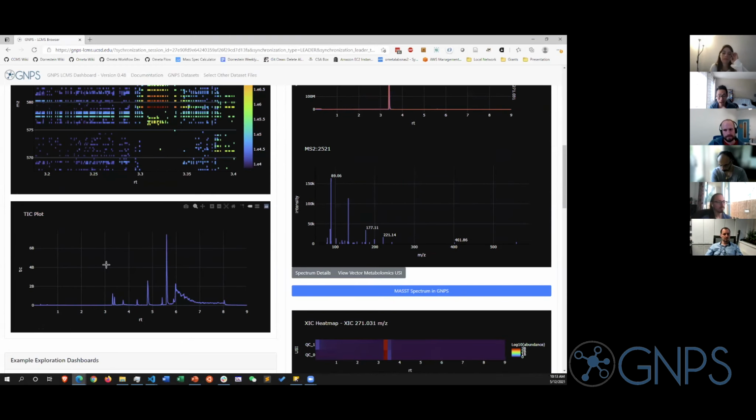This comes from Catherine Maloney, and they've been teaching using this at Point Loma University for undergraduate chemistry students. They just did a session last week. These classes are relatively small, about 15 to 20 students. What I thought was cool about using the dashboard is they were able to have students explore data. And these are undergrads, and they did it in a linguistics lab, a linguistics computer lab. So it shows the portability of it all.